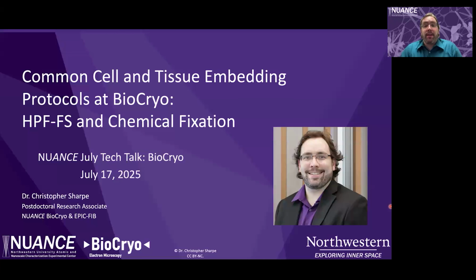Today I'm going to be presenting on behalf of BioCryo, and my name is Chris. I'm a postdoctoral research associate in both BioCryo and in EPIC-FIB. And today I'm going to be talking to you about common cell and tissue embedding protocols at BioCryo, in particular high pressure freezing, freeze substitution, and chemical fixation.